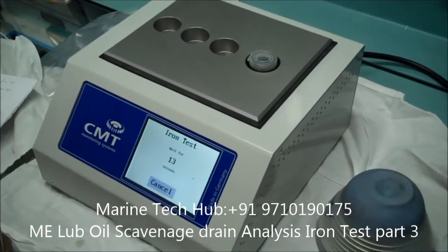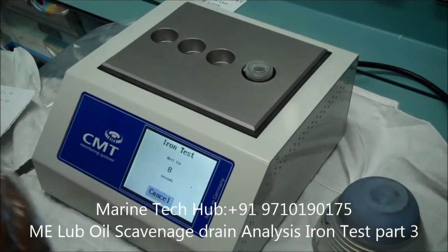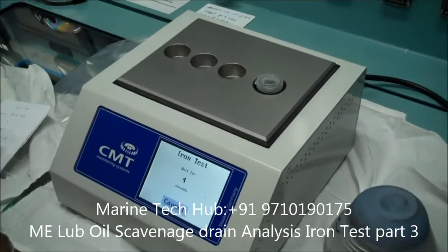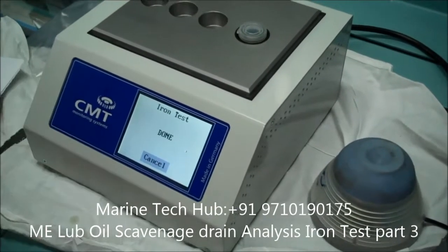And what about 50 ppm? Less than 50 ppm means the condition is very good — it is a minimum iron content, meaning minimum wear down in the under piston sample. So it means below 200 ppm is acceptable, but we will see what results we get.